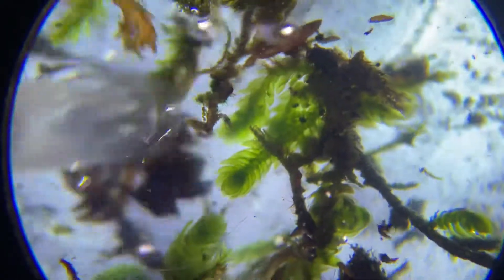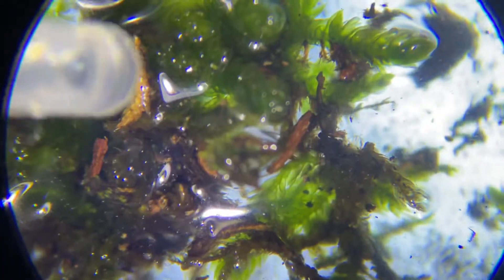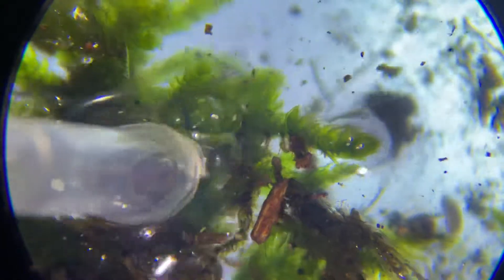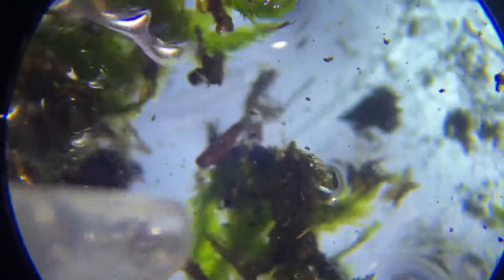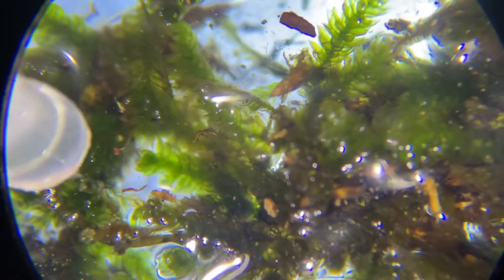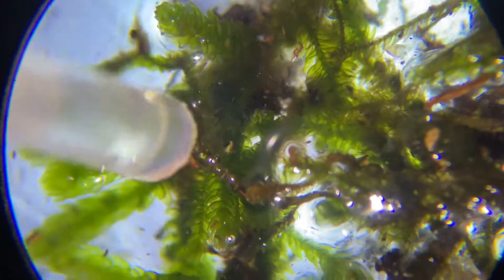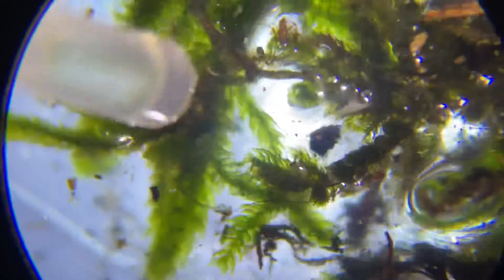You just fish around in here — this could take minutes or it could take hours. If you're not satisfied with what you see, you put this back and draw some more water and more pieces of moss until you find one. Sometimes you can go hours without finding them — that sample just didn't have them, or it had one and you passed it up.